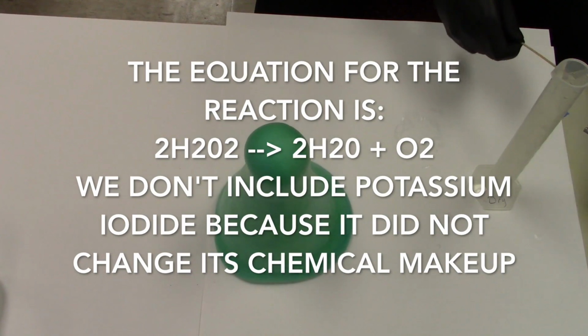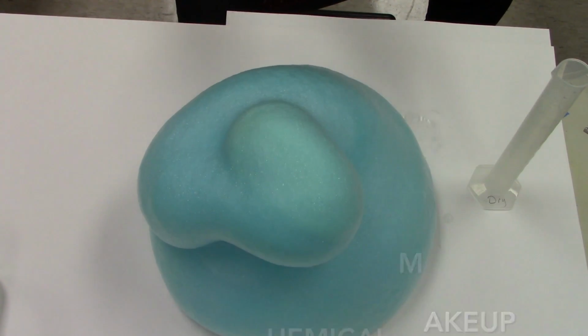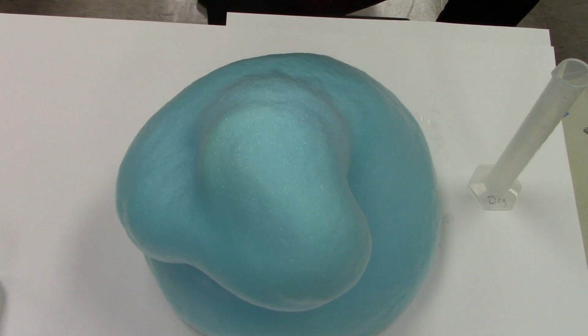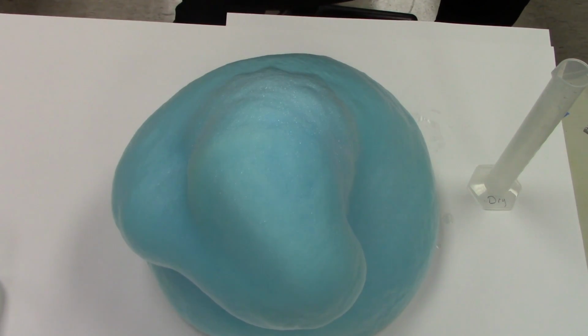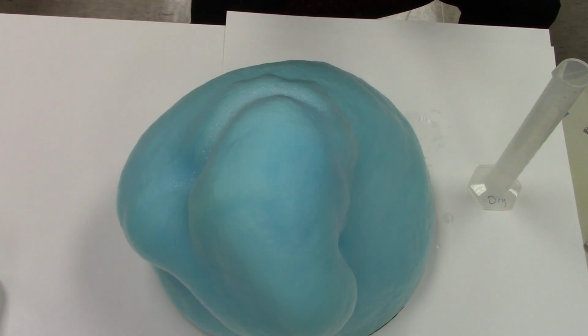Now, that'll keep expanding on us. Now, do you see the smoke coming off of it? That's the heat, so it creates a lot of heat. Now, the soap is why it got all bubbly, but what's inside those bubbles?